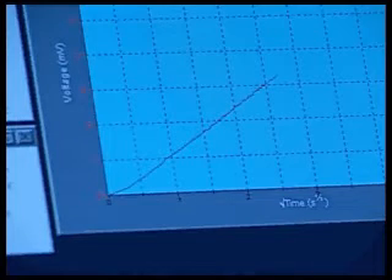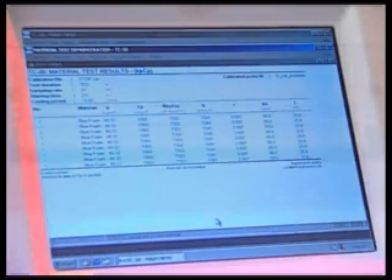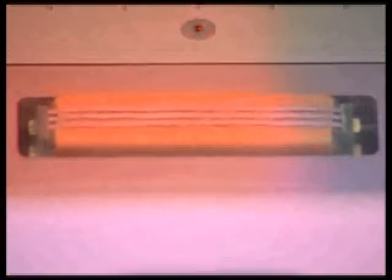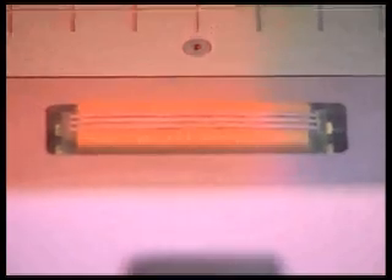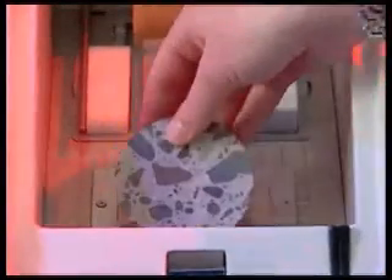The results are generated on screen in real time and available instantly in tabular form upon completion. Testing with the Mathis TC30 is that simple and that fast. The Mathis TC30 makes it easy to accurately test the thermal characteristics of many types of materials, including liquids, solids and thin films.